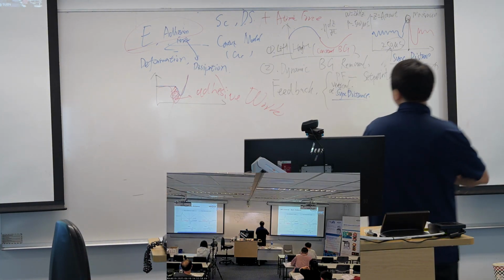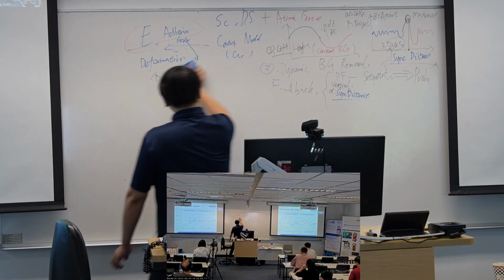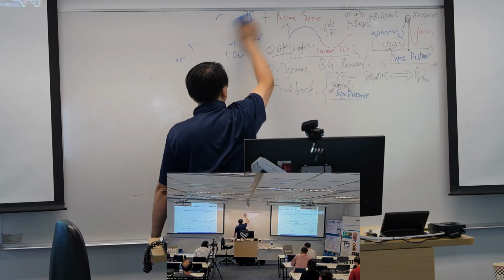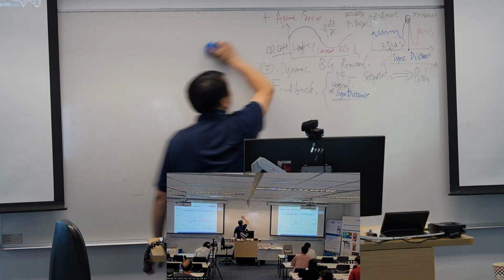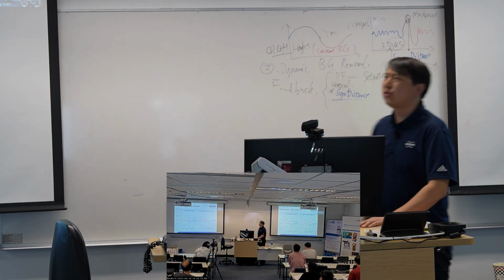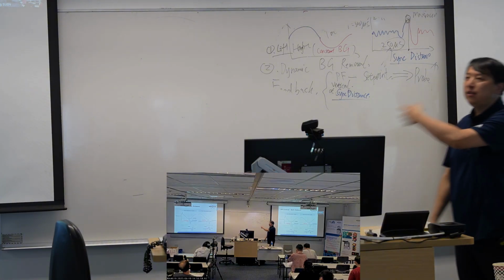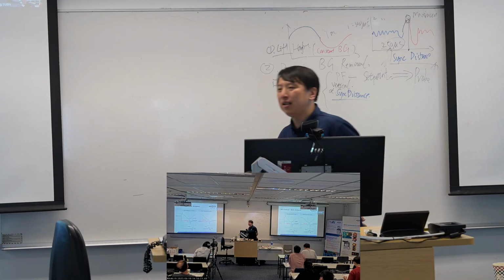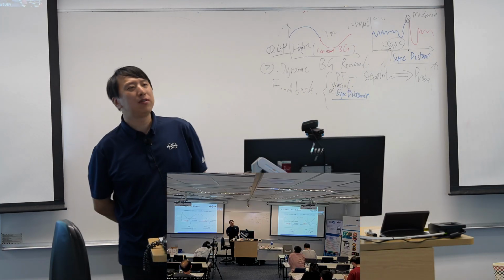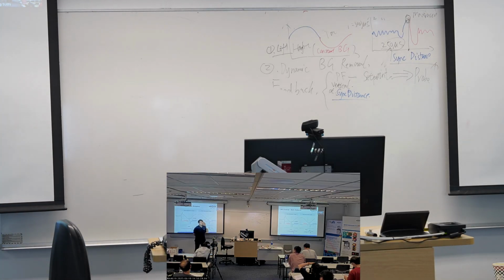For this slide, we want to introduce more about the synchronize or sync distance. Bruker invented this technique in 2009, I think, and then released it. After 3 or 4 years, our users gave us some feedback and told Bruker that they had done some stupid thing.